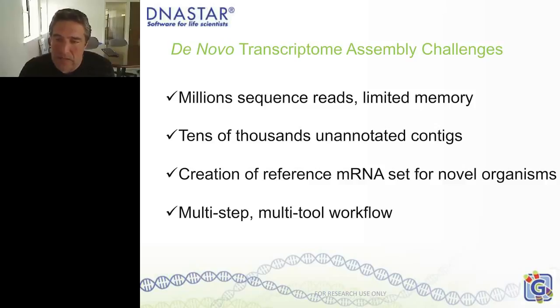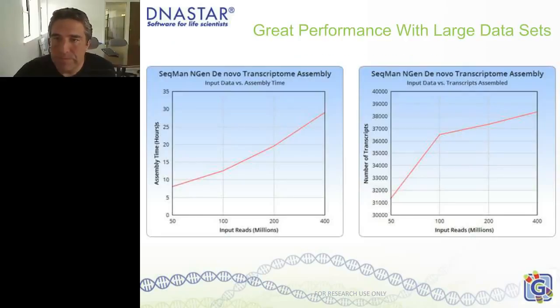of those annotations. There's also, sometimes you may need to edit individual transcripts that are important to you. You may need to piece them together. So this new workflow automates the more difficult steps and gives the user the ability and some flexibility to work with the output.